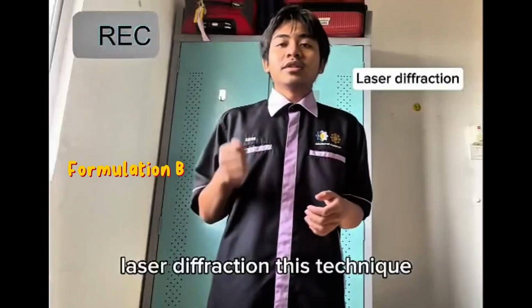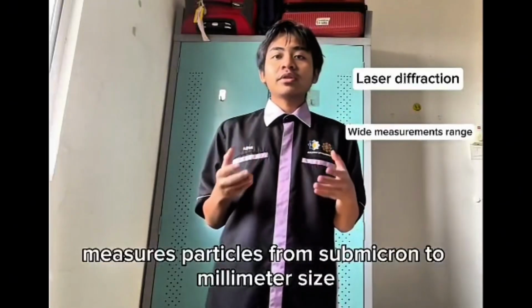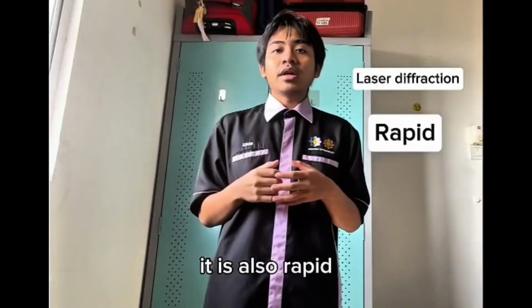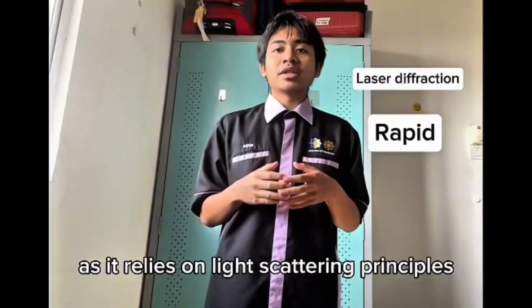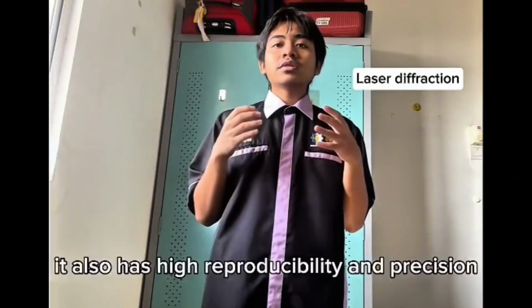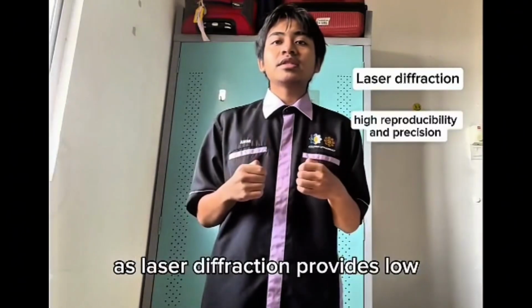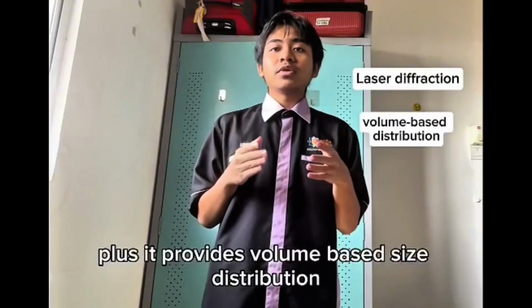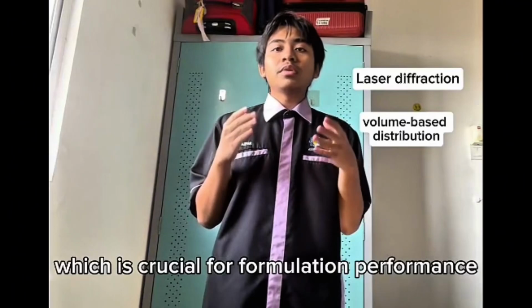Laser diffraction. This technique measures particles from sub-micron to millimeter size, ideal for 50 until 500 micrometers. It is also rapid as it relies on light scattering principles like Mie or Fraunhofer theory, which can analyze non-spherical particles effectively. It also has high reproducibility and precision as laser diffraction provides low relative standard deviation between runs. Plus, it provides volume-based size distribution, which is crucial for formulation performance.